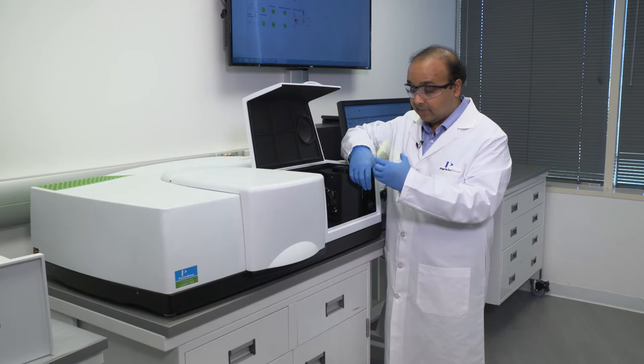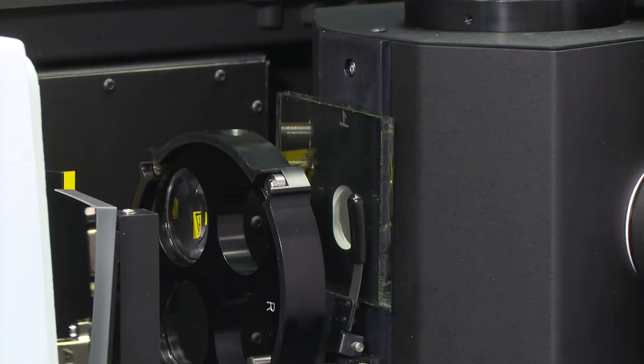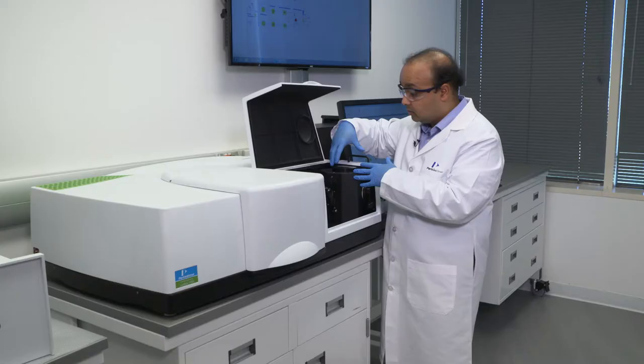But just as we showed with the polymer film, it is also possible to measure transmittance through a glass sample here. This is a thick, about 5 mm glass sample, which we're going to measure on the integrating sphere. And similar to the polymer film, we'll position the glass sample over here, and the light after scattering will go into the sphere and all the light is measured within the sphere itself. So very easy to position samples in and out of the transmittance port.